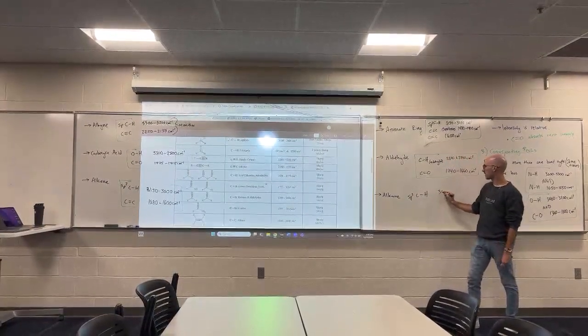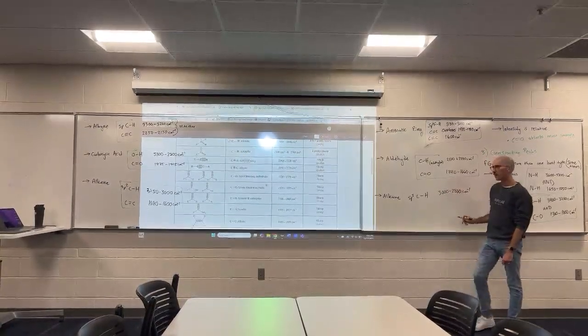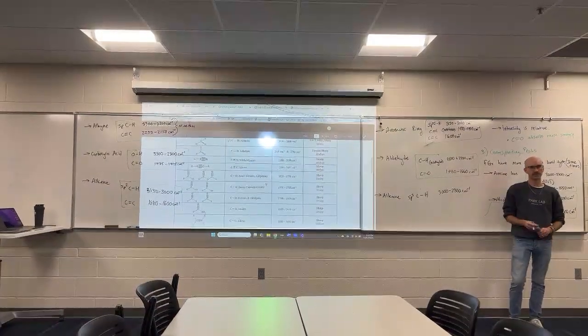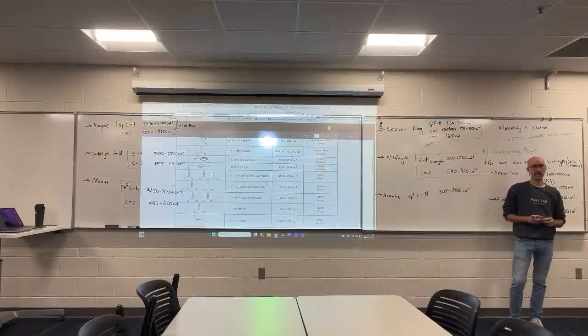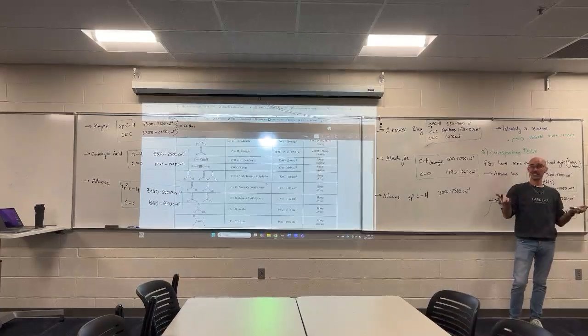If we were looking for an alkane functional group, we would be looking for sp3CH, which absorbs from 3000 to 2800 wave numbers. What's the other main bond type in an alkane group? Kind of the defining feature of the alkane functional group. Carbon-carbon, single bond.